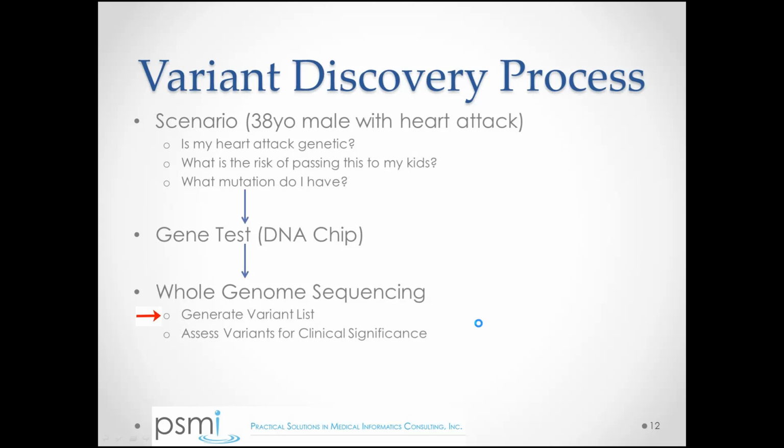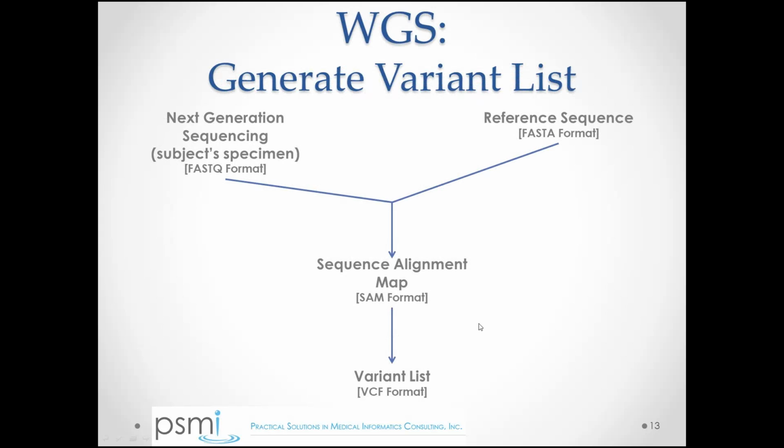So let's see, here we go. Okay. And my guess is that for a lot of you, some of these file formats and some of the standards that are part of the bioinformatics community will be new, but I also think it's just kind of super interesting to understand the whole pipeline process of next generation sequencing, in part because it'll help you get a qualitative sense of the quality and reliability issues.